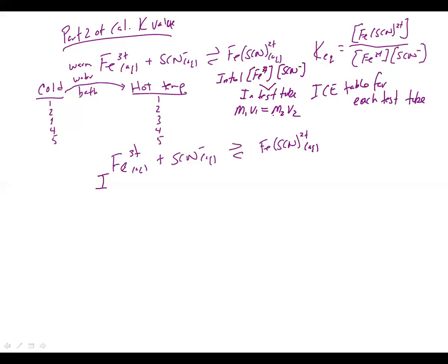So you want to make sure that you don't use the concentration that's on the bottle. You need to use the concentration for each of these test tubes in this part and all the other parts as well.